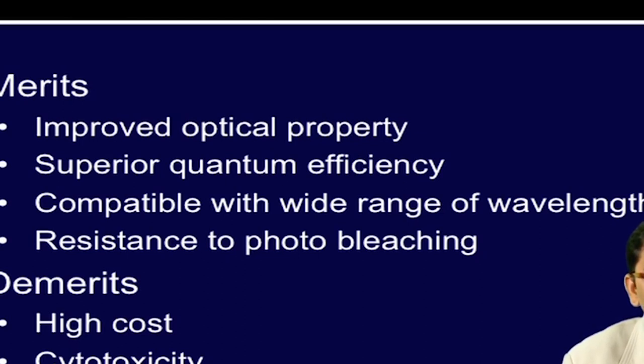A systematic cytotoxicity study should be performed if you want to use these GNPs for different protein microarray based applications. The high cost, cytotoxicity, and non-uniform size and shape of the nanoparticles are some of the limitations of using GNPs as a sensitive detection platform for microarray experiments.